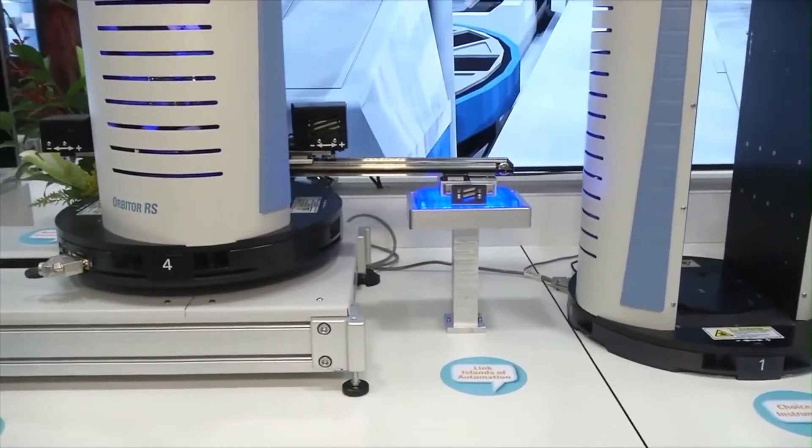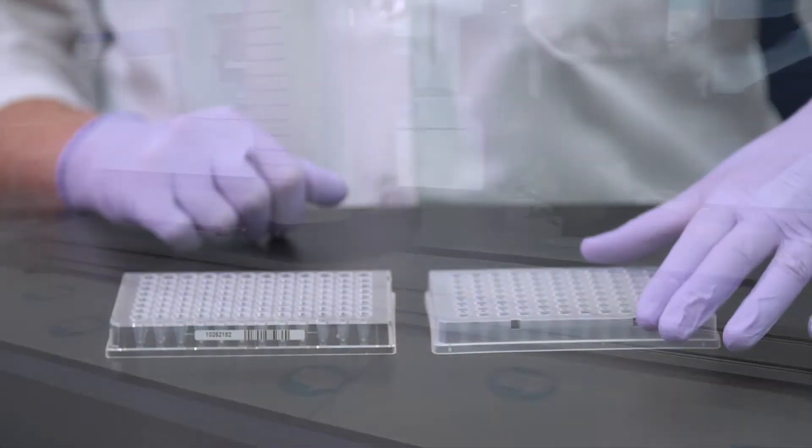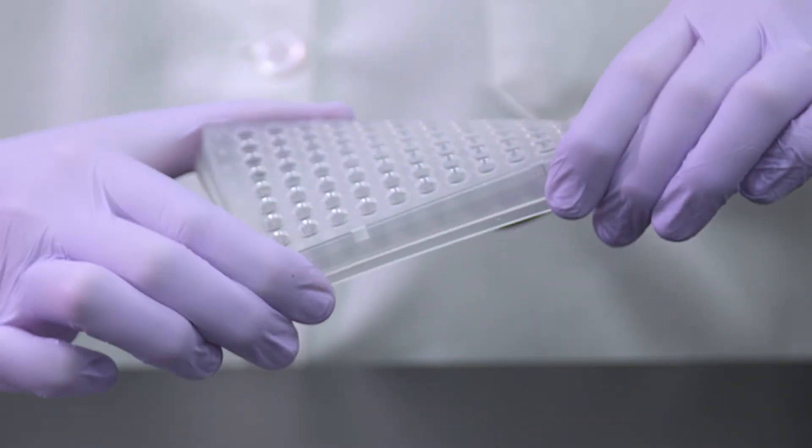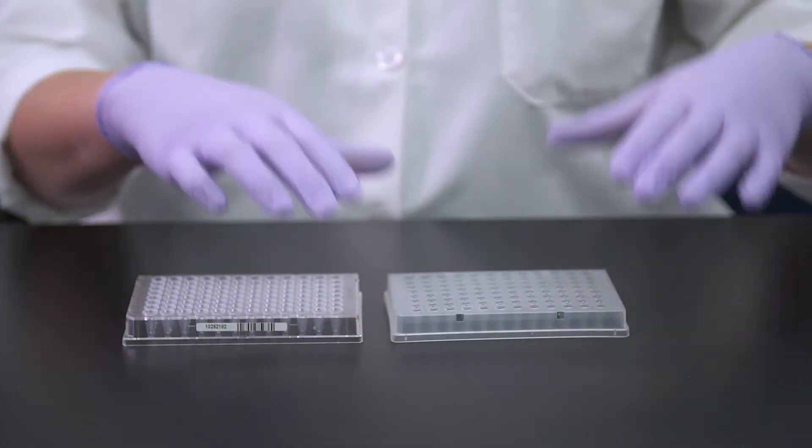A standard polypropylene PCR plate is not able to withstand the pinching of the plate introduced by the grippers. Therefore, the plate becomes distorted, making it difficult to place the plate in its next deck position on the robot or the thermal cycler block.